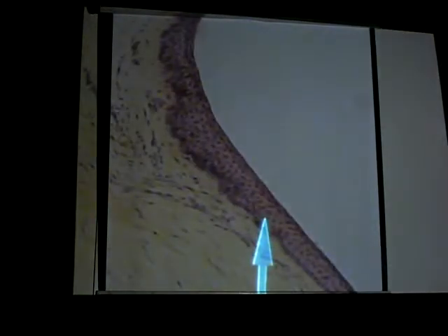Okay. Alright, so this transitional region here is called the limbus. Alright, so that's where you start to see this change moving from your corneal epithelium into what's called your bulbar conjunctiva. And I have a slide with the eyelid, so it'll kind of make more sense when you see the slide with the eyelid. And then your stroma here, you'll see a transition into the connective tissue of the sclera.